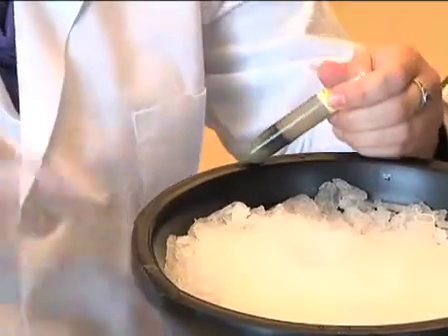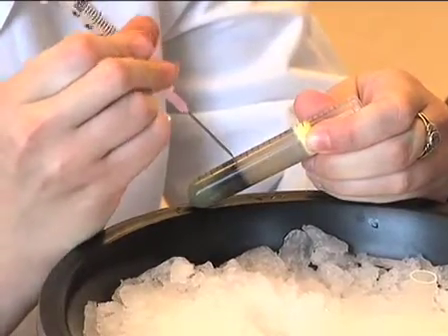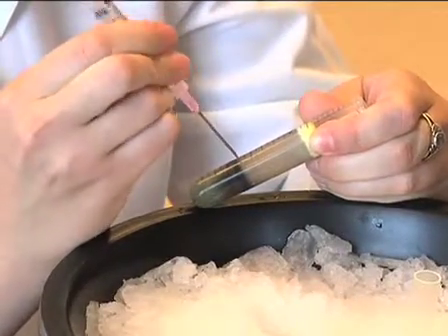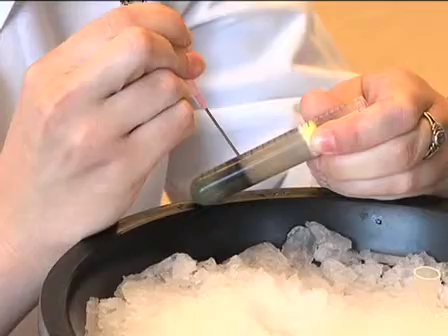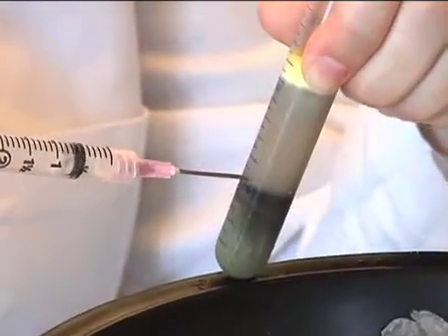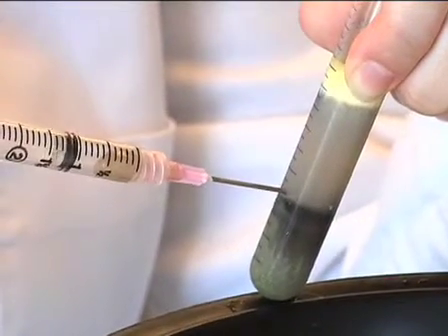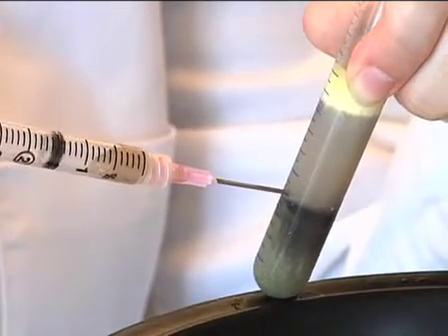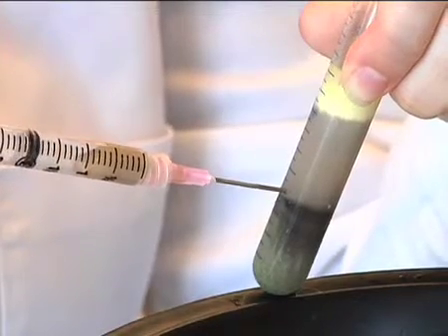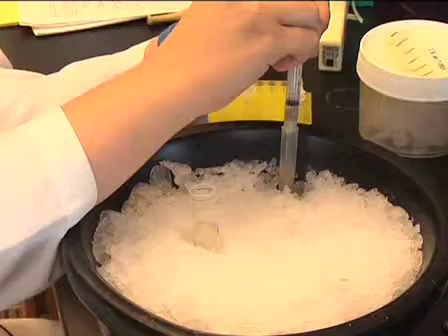Remove the crude extract by piercing the side of the polypropylene tube with an 18-gauge needle attached to a 3 ml syringe. The crude extract contains solubilized nuclear and cytosolic components, light membrane from the ER nuclear envelope, ribosomes, and heavy membrane organelles including mitochondria. The extract can be stored for one to two hours on ice.